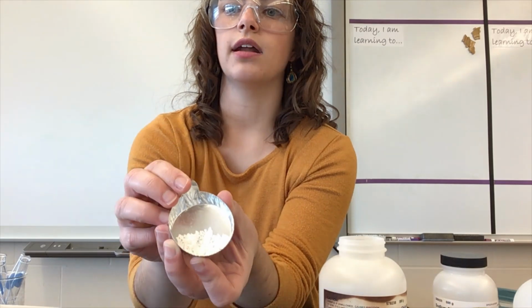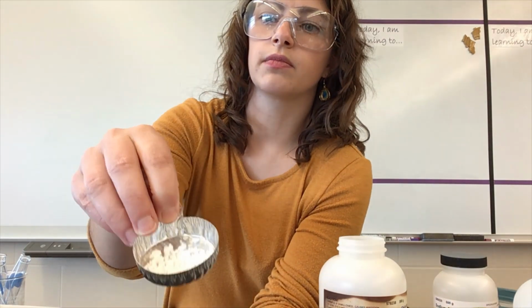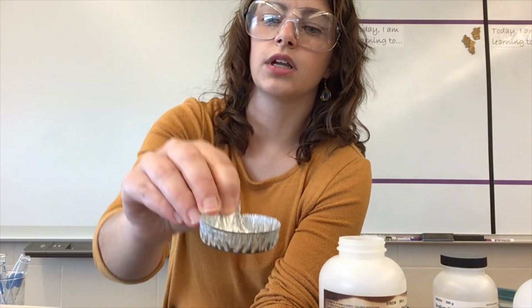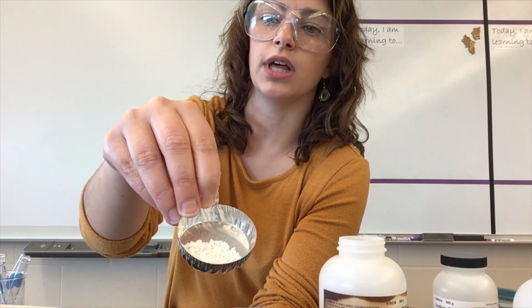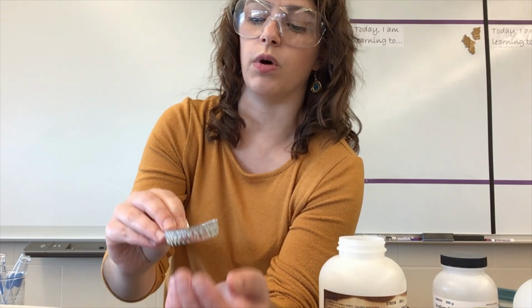So I'm going to tip that. The lighting is not the best. I'm going to drop in a still picture of this so that you can pause the video if you want to be able to make notes on what it looks like.